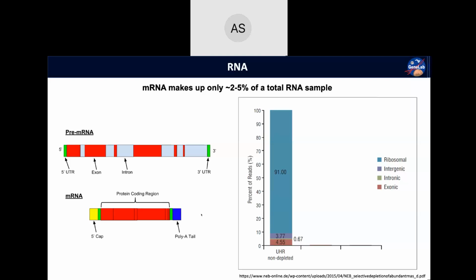However, although mRNA is very interesting, especially for differential gene expression, which is what we're going to be doing, when you do that, you'll also kind of minimize the other types of RNAs that are there. So as some of you guys may have learned from some of your courses, there are a bunch of really cool RNAs that do important stuff, such as microRNAs. We also have long non-coding RNAs, there's snoRNAs, there's small nuclear RNAs, there's all sorts of RNAs that might be interesting to us. And so we might not want to just look at messenger RNA, but we might also want to look for differential expression of or changes in the amounts of microRNAs or long non-coding RNAs or some of these other RNAs that are not messenger RNA.